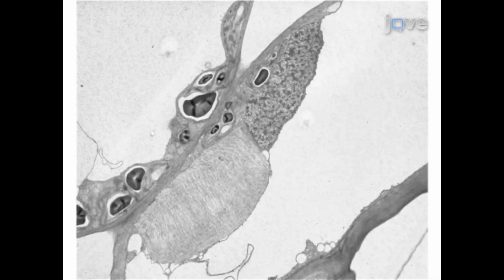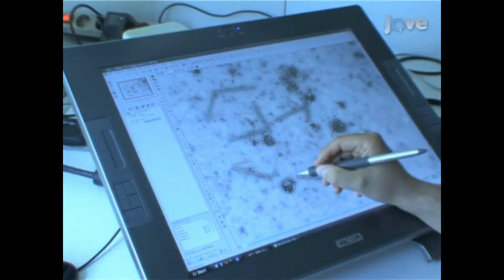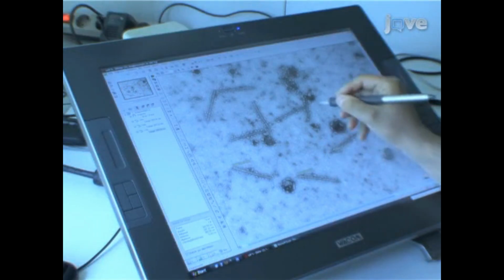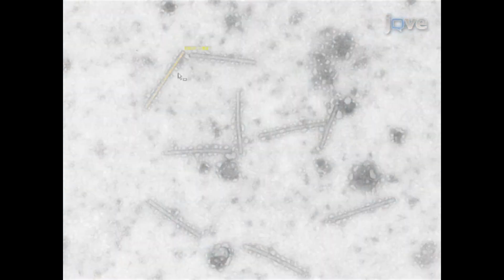The sections containing the tissue samples that were automatically processed by the microwave tissue processor are also examined with the transmission electron microscope. Analysis of the images acquired by TEM can be performed using any image analysis computer software with a particle analysis tool. Measure the length and size of at least 100 randomly chosen single virus particles on the micrographs taken from the negatively stained samples.